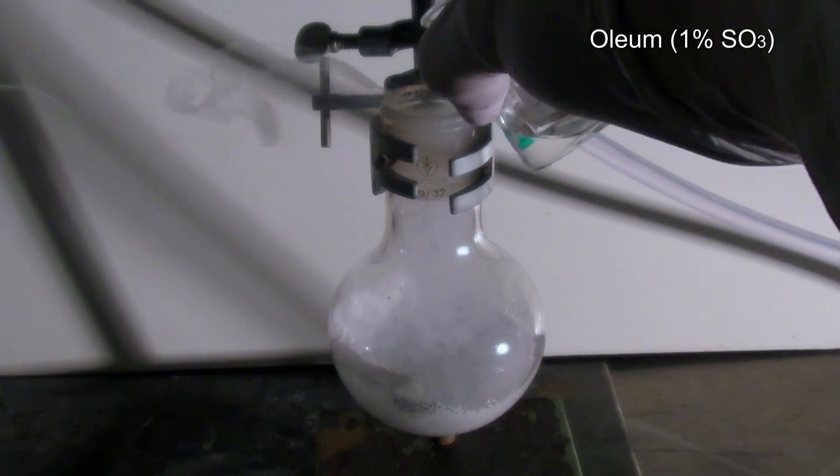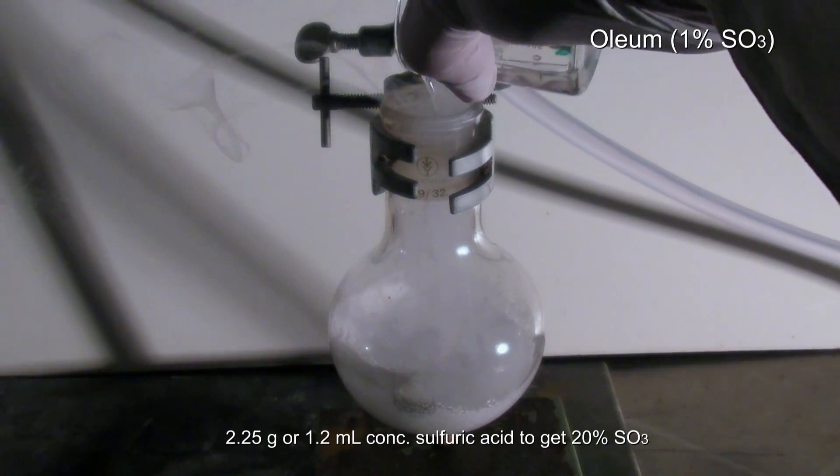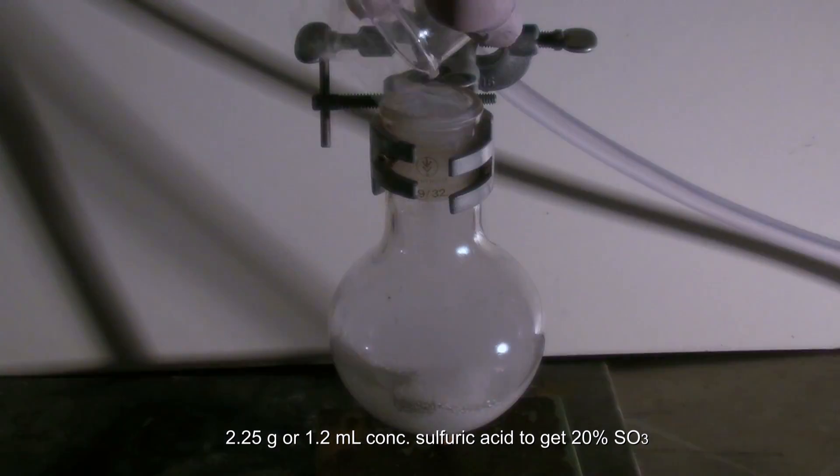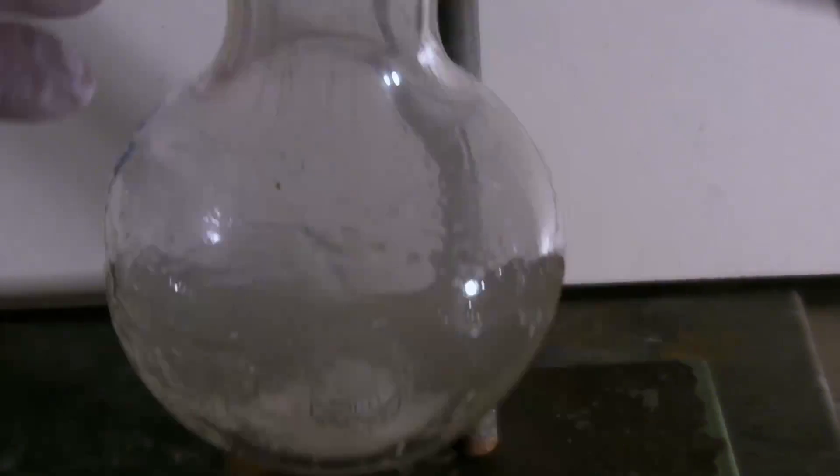To get 20%, only 2.25 grams or 1.2 milliliters of sulfuric acid had to be added. Due to the sulfur trioxide dissolving pretty slowly, the mixture was left to sit overnight.